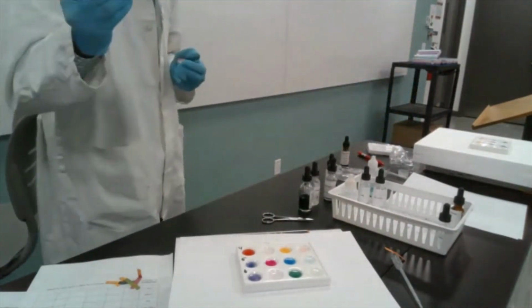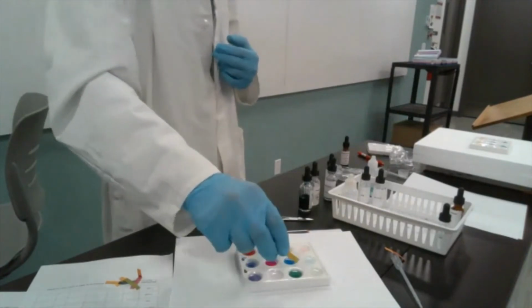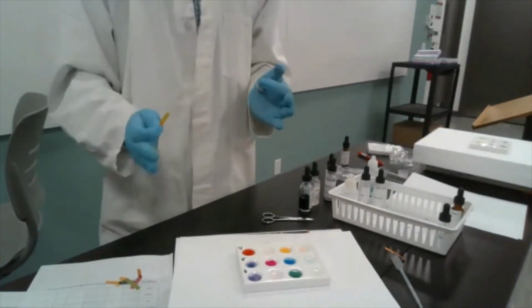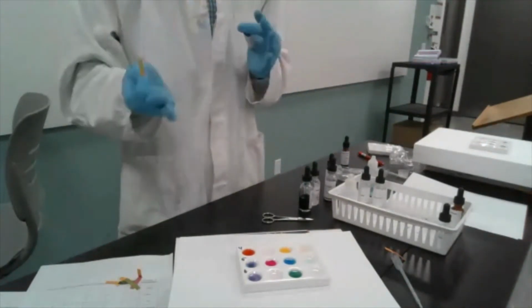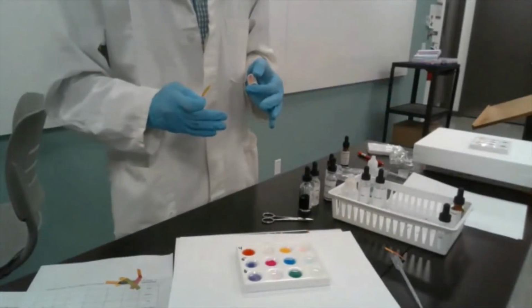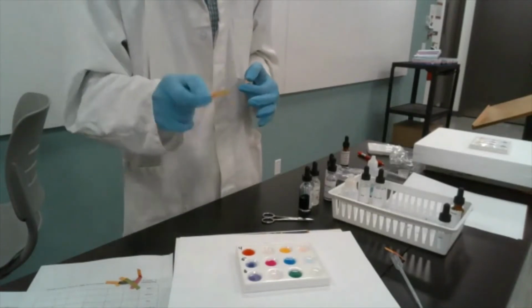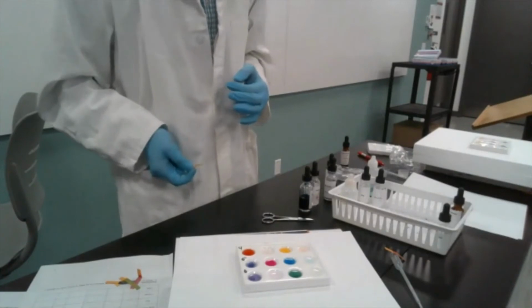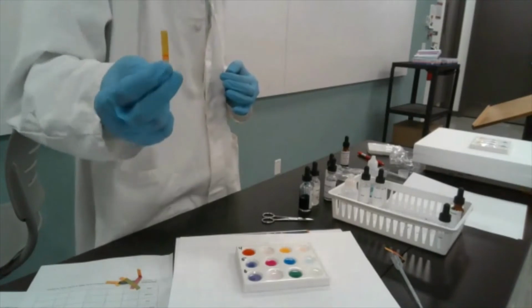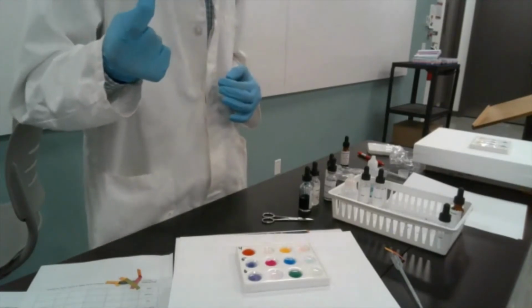So soap solution, in fact, has pH very close to 7, and that explains that greenish color of the bromothymol blue, right? Because we're almost at that border point, so it cannot decide whether to change to blue for basic or the yellow for the acid, right?